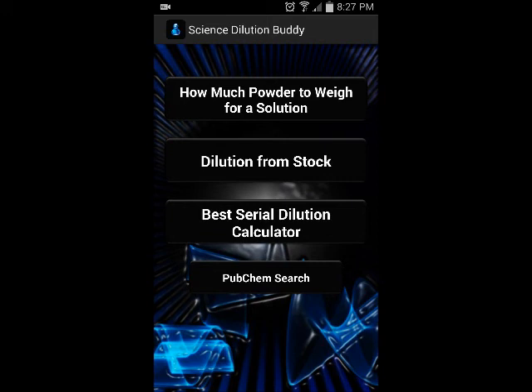This app has been designed for all different sizes: tablets, small devices, and medium to large size cell phones. The first thing you might notice is that if you've already downloaded my Best Serial Dilution Calc app, this includes that app as well, but there's some added functionality that I'll talk about in a little bit.